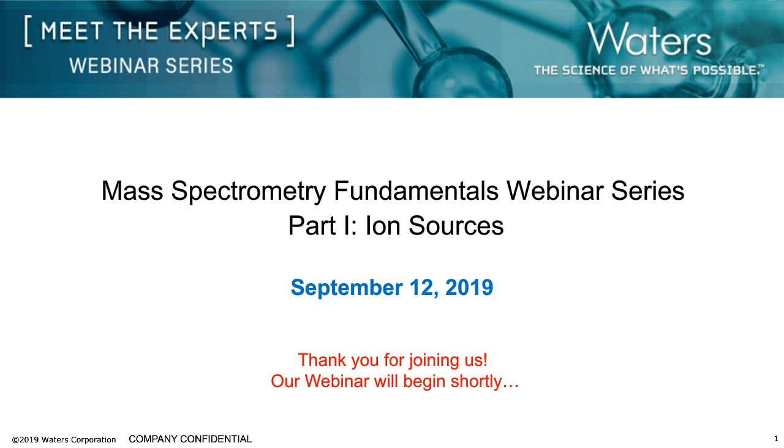This edition of our Meet the Expert series will feature part one of a three-part series focusing on the fundamentals of mass spectrometry. Part one today will focus on ion sources. Part two will focus on mass analyzers and detectors and will be held on September 19th at 1 p.m. Eastern, 10 a.m. Pacific. Part 3 will focus on advanced topics in mass spectrometry and will be held on September 26th at 1 p.m. Eastern, 10 a.m. Pacific.